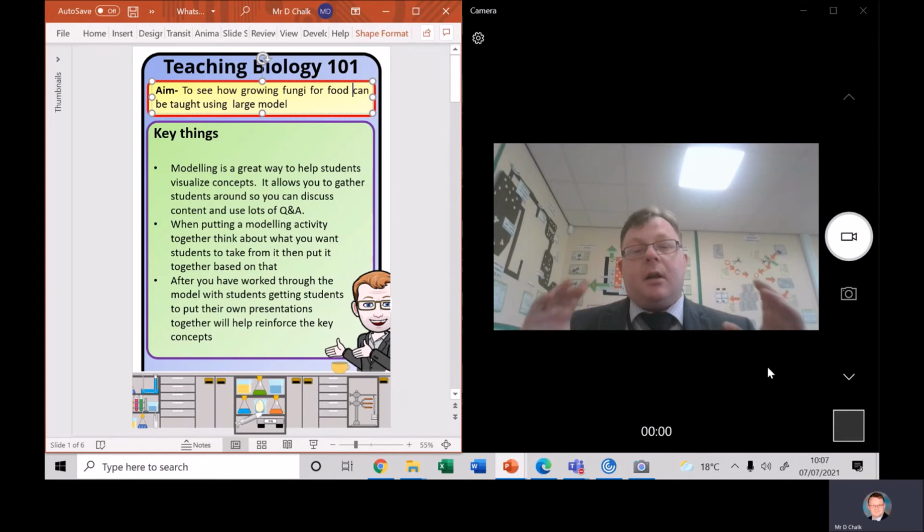After they've finished, like I've said previously, a good thing for them to do is to either annotate their own diagrams, or something else that I didn't mention is they can put their own small group presentations together on the topic of growing fusarium using a bioreactor, that really helps influence what they are looking at.